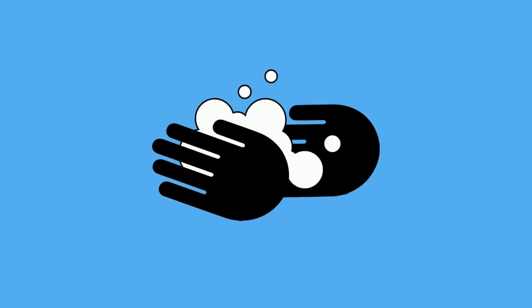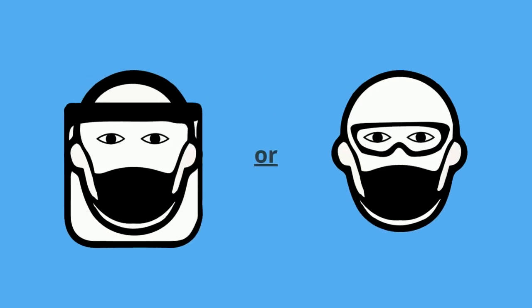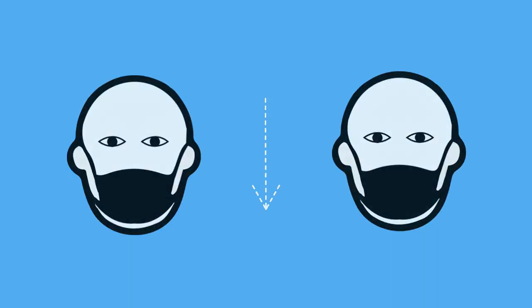Next, perform hand hygiene carefully before touching your face. Then remove the eye protection by leaning forward and pulling away from your face, whether that is the face shield or goggles.